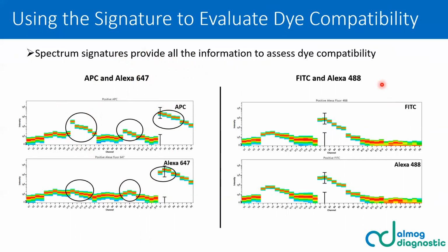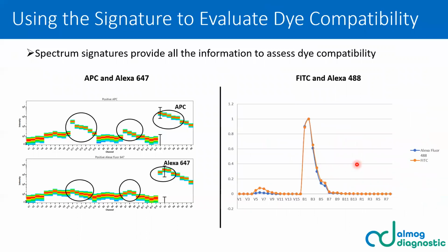On the right, we can see FITC and Alexa 488. We can see that these signatures are much more similar, and we can also see it in the overlay histogram.